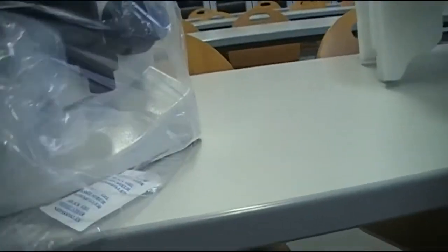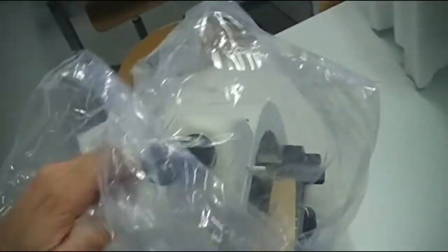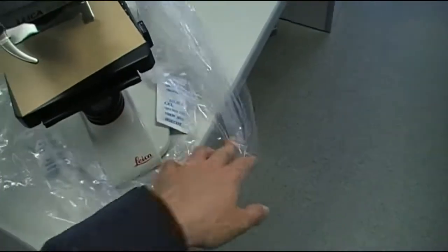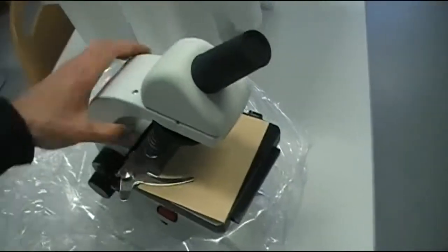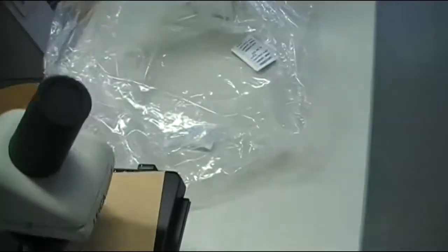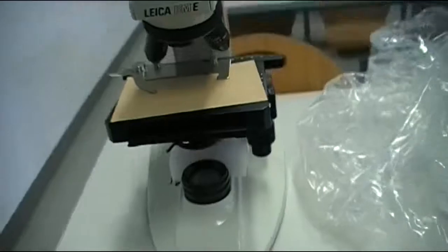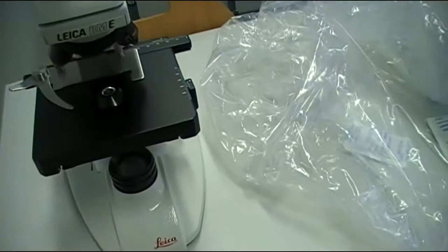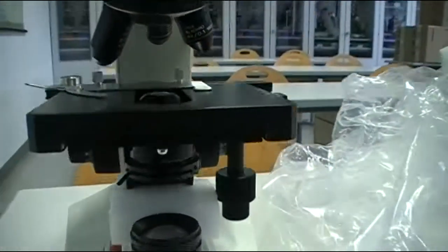The plastic bag seems to be sealed — can this be possible? No, the opening is here on the side. Okay, here we go. Very nice and solid — that's how it looks like. The condenser is here.